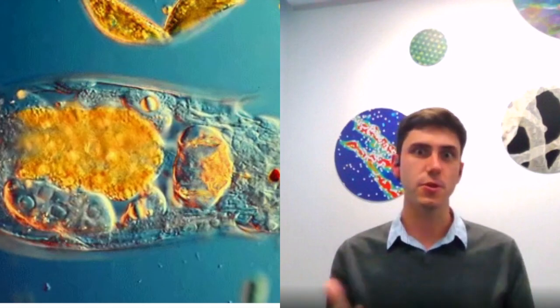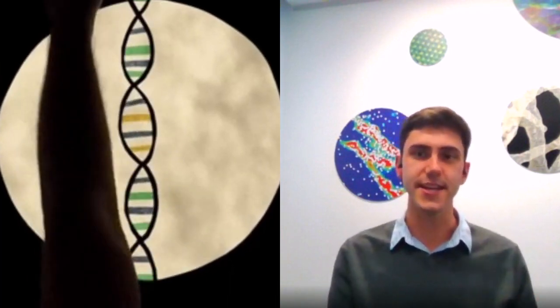It's the solution of life, proteins, DNA. Cryo-TEM is a workflow that allows us to look at things like proteins and DNA using the transmission electron microscope. My current role is to take that idea and apply it to atom probe microscopy, so that we can get 3D atomic maps, not of water and ice, but of the proteins, DNA, and other biological materials which natively exist in water/ice.